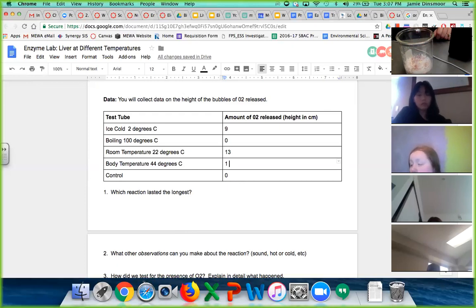It relit. Right, and I could just keep doing this all day because there's going to be oxygen getting released, which will just keep relighting the stick. So this is a way that I could prove that oxygen is present, right? Because if I just hold the ember outside of the reaction by itself, it's not going to do anything.